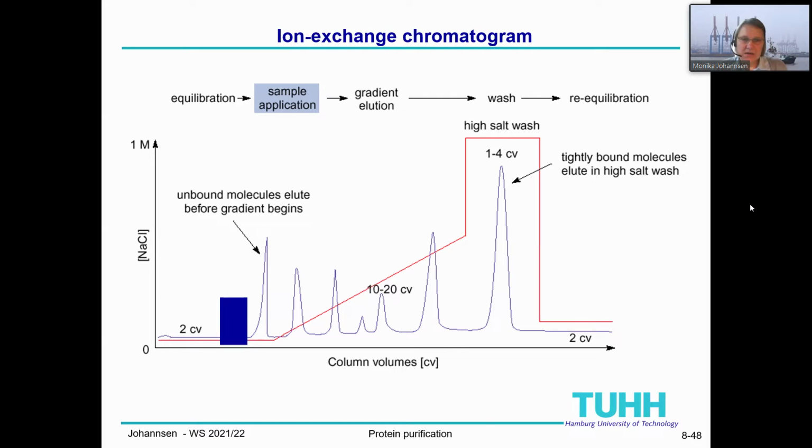So this is how an ion exchange chromatogram looks like. This is again shown not in retention time, but in retention volume here. We need at least 2 column volumes to equilibrate the system. Then we would inject the sample, and then the elution starts, and it starts with eluting everything which is unbound, and then there's a certain time where we can separate the components, proteins.